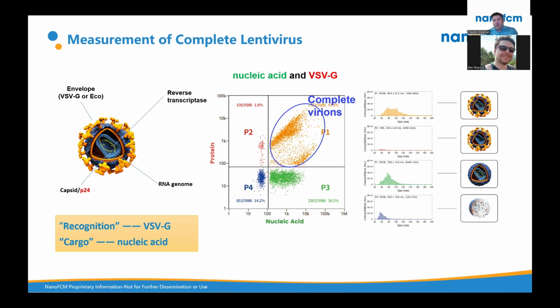And then we have P4. These are our non-staining particles. We saw them as like 10% in the membrane stain. And a lot of people would term these process-related particles, especially as we move through a separation process. These are particles which can be identified, can be quantified, can be tracked. Their identity is not easily known based on the staining methods we're going to use here. So process-related particles we're able to put our finger on and quantify, and quantify our active particles in here too.